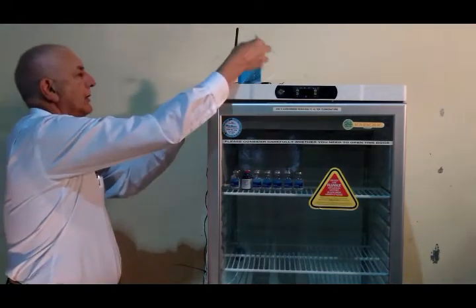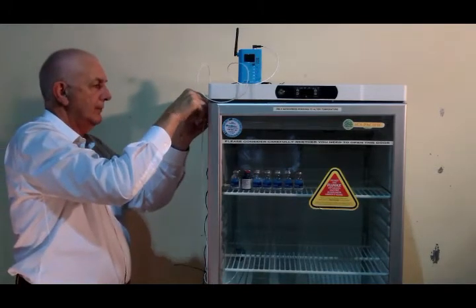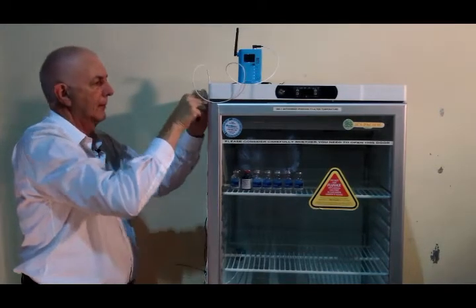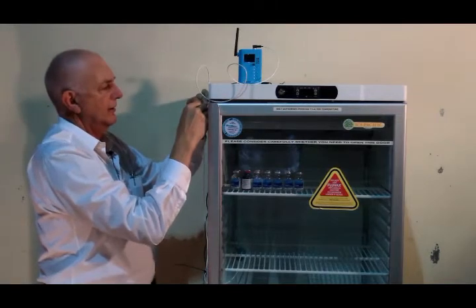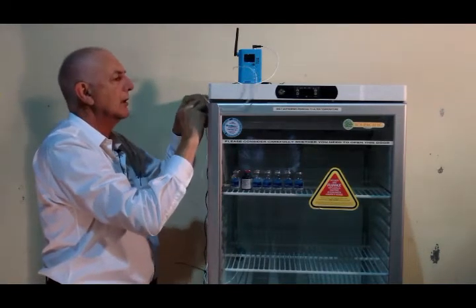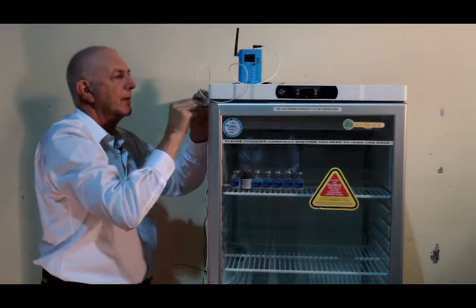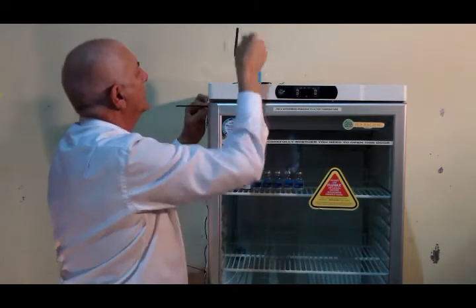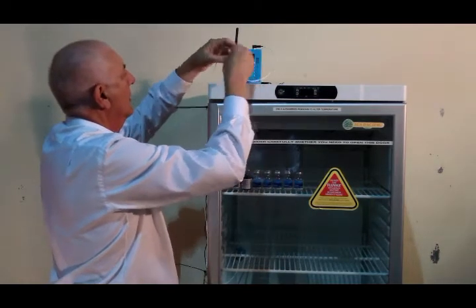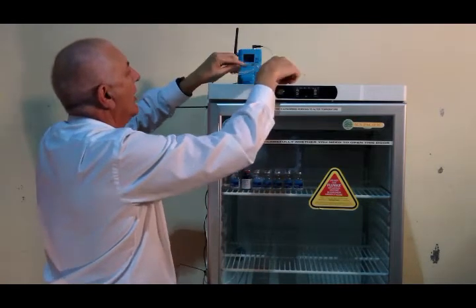Apply pressure to it for a while to keep it on. And let's do another one up the top. Each one is provided with three. Very simple to install. Just tidy up the rest of the cable with the original tie that was provided.